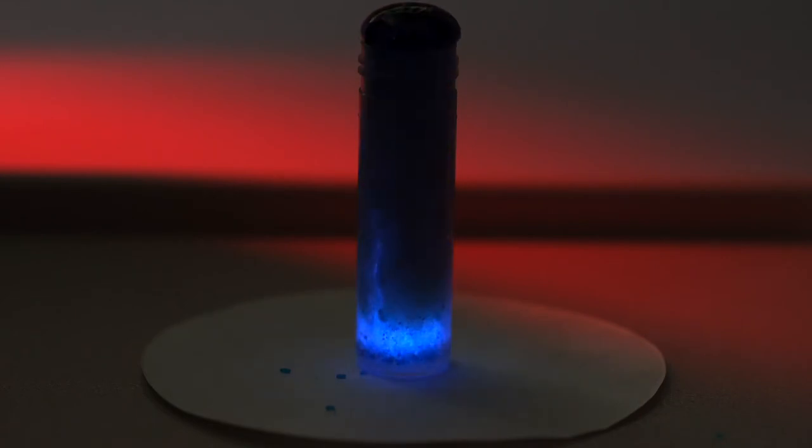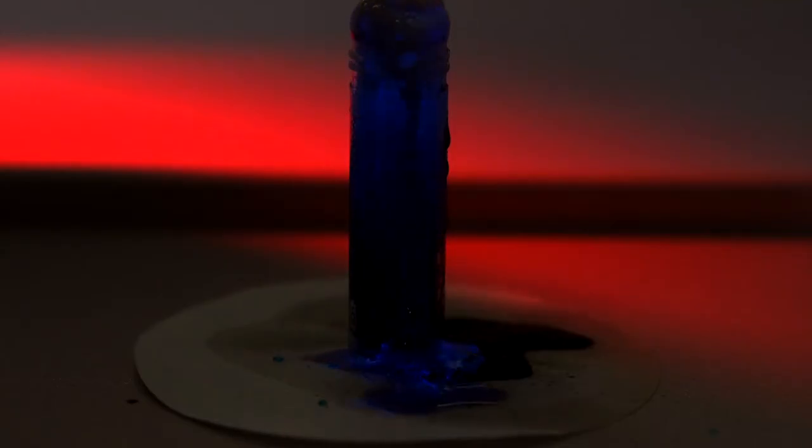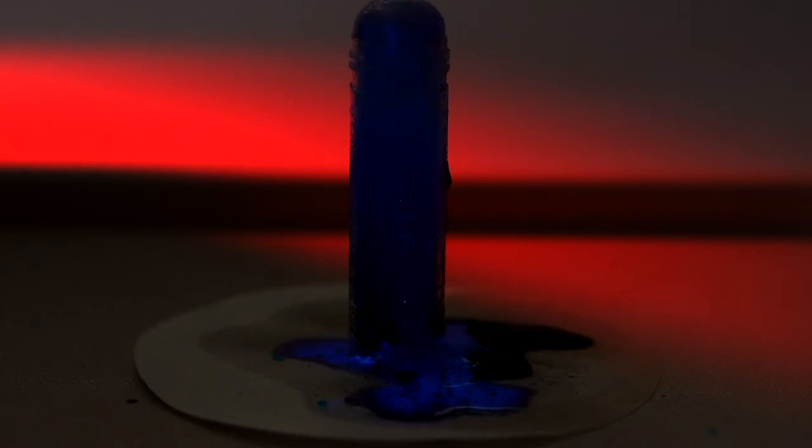Copper sulfate helps hydrogen peroxide oxidize luminol, which causes a blue glow. As the hydrogen peroxide decomposes, it releases oxygen bubbles, causing the mixture to foam. The oxidation of luminol and decomposition of hydrogen peroxide make the glowing volcano erupt.